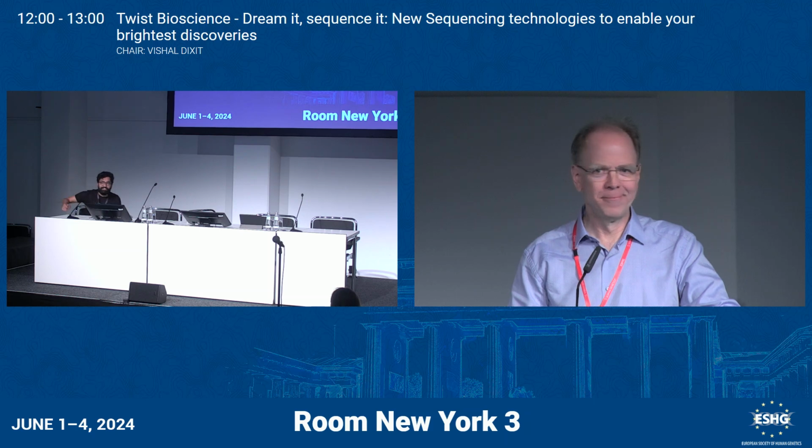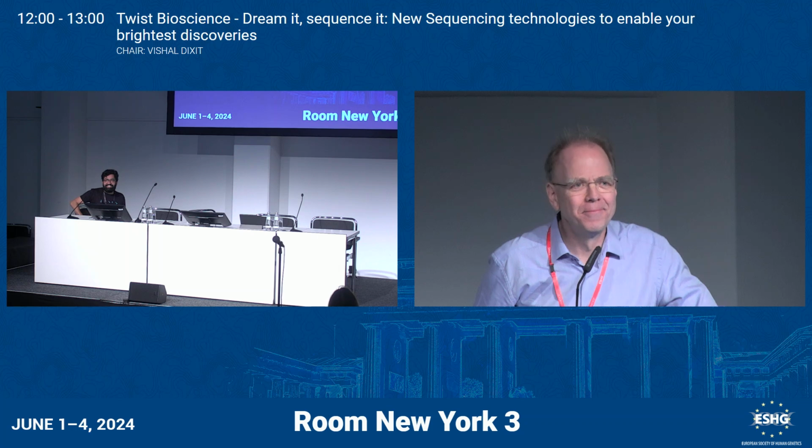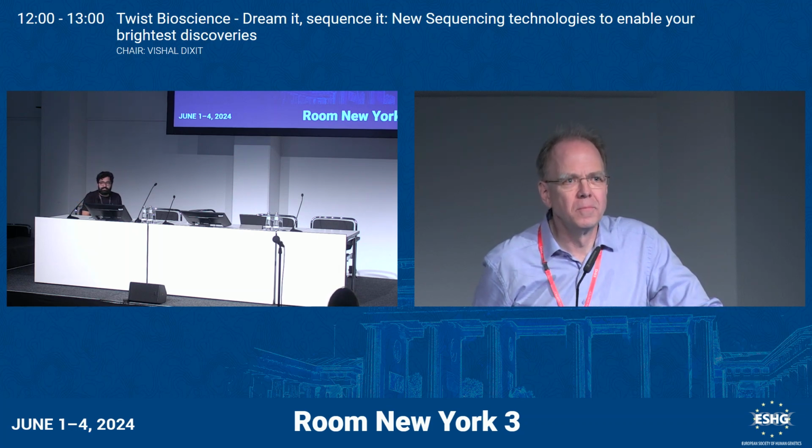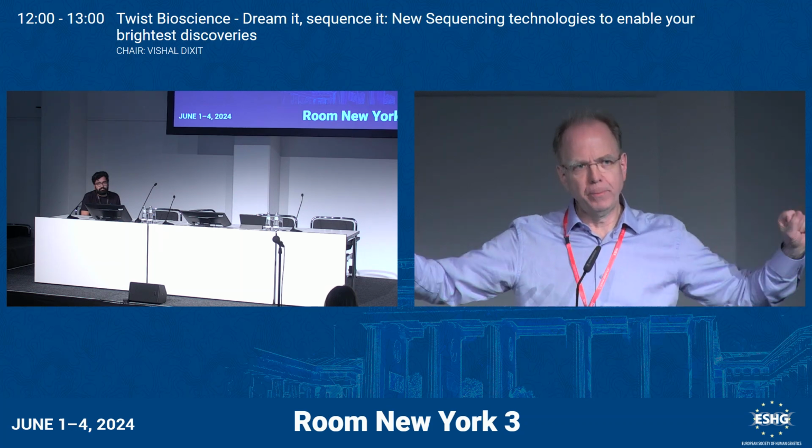So Tina has a question. Can I answer your question? Because you actually discussed the LPA gene, right? The LPA gene is in the Twist dark genes panel. We actually just have a preprint out on the coverage of this gene. Our collaborators at Baylor were able to resolve it very well. So I think we should talk about it because it's actually working in the dark genes panel. I haven't seen the data that you can separate the Kringle 4-2 repeats.